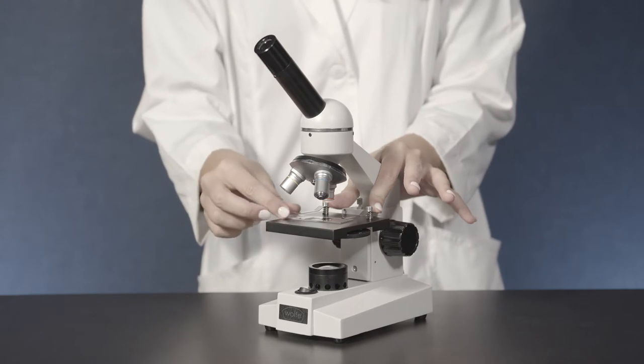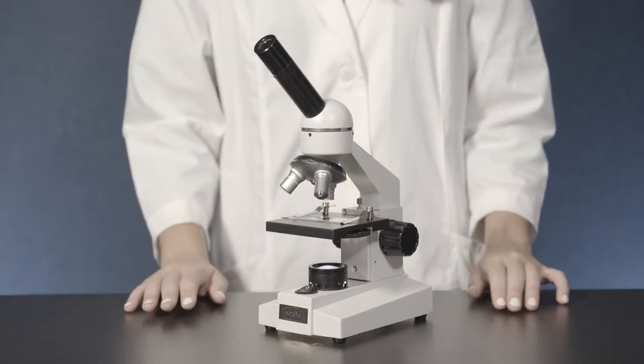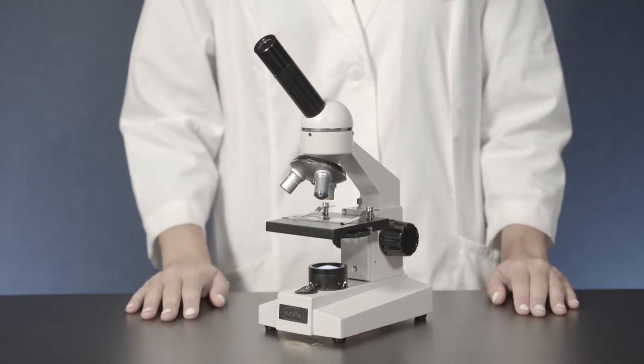This level of magnification is appropriate for viewing pond water, protozoans, or virtually any thin-sliced mounted specimen.